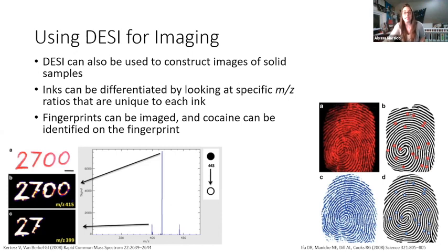So yeah, so cocaine, you can actually, and people have done studies like this with fingerprints with not drug samples, but even just lotion, right? My hands get so dry in the winter. I've got to put lotion on every single day, at least 3 times a day. If I touched a surface and we analyzed it by mass spec, we may be able to identify my fingerprint because my fingerprint will have specific ions in it from my lotion that yours may not have if you use a different lotion or don't use lotion at all.